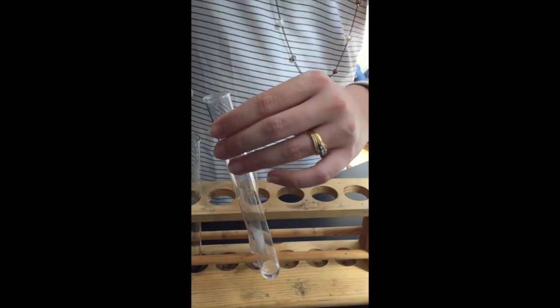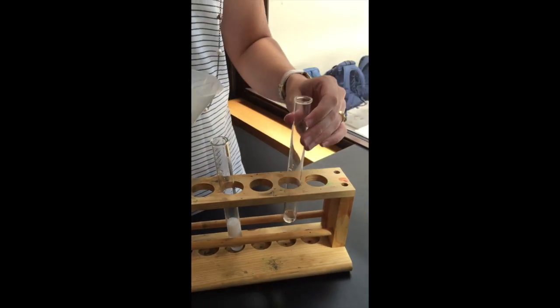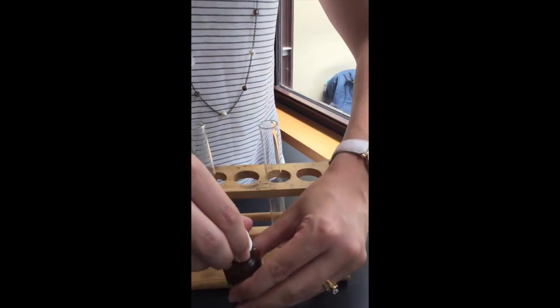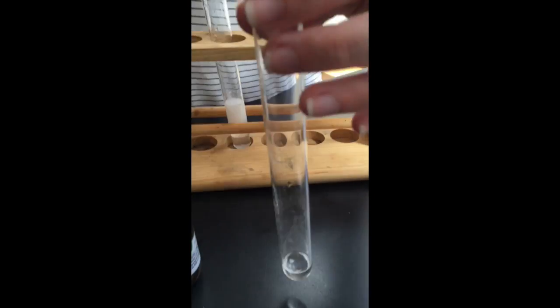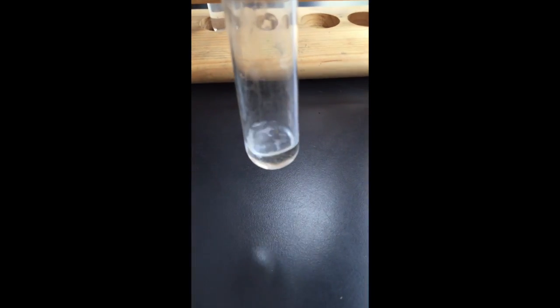Once you've got enough of your soil and water mixture that's been filtered, do the same thing — add a couple of drops to see whether there are chlorides present in that soil. In this case you can see there is no colour change and no white colour, which means there are no chlorides present in our soil sample.